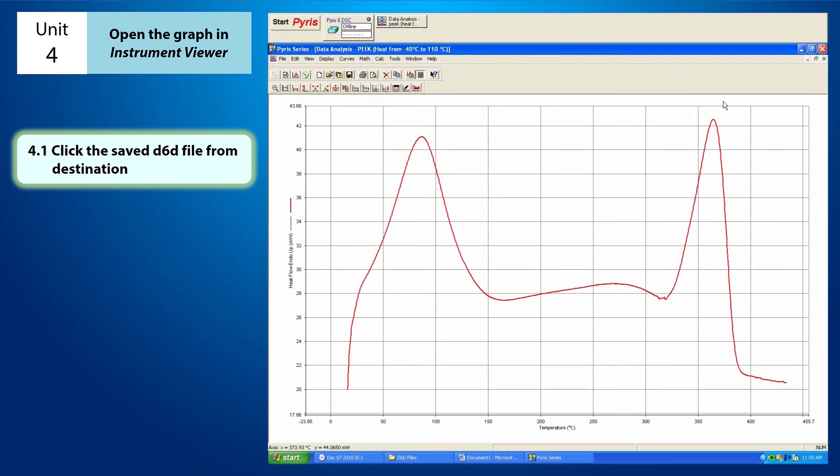That is how you can open the graph on the instrument viewer. That's all for this tutorial. See you guys on the next tutorial video.